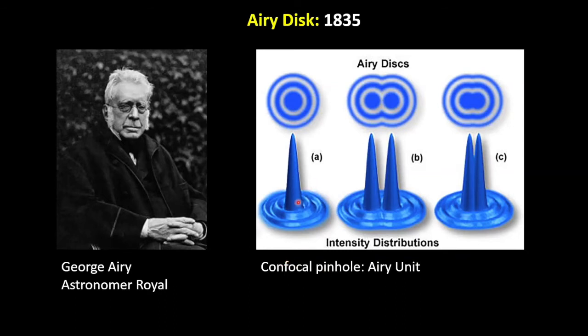So for example, in this case, when the light passes through a small pinhole or aperture, you form this ring pattern. Because of the diffraction property of the light, the center becomes a very bright spot, then becomes dimmer, forms another brighter ring, dimmer again, and another ring.